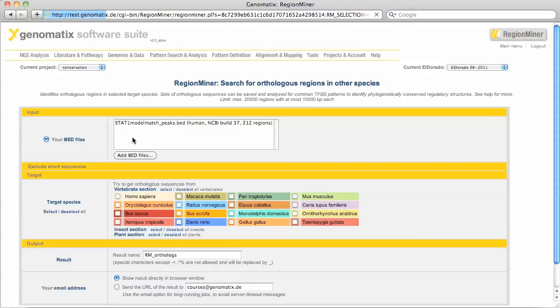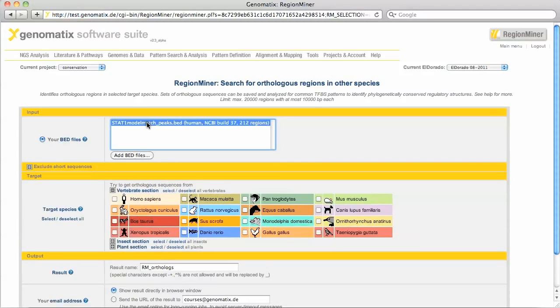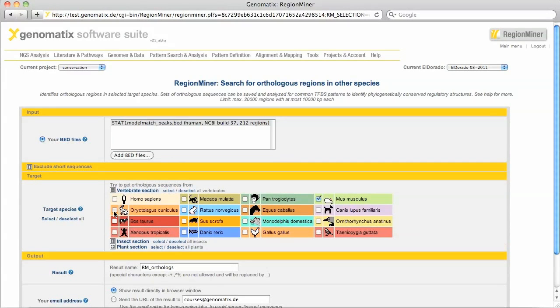Now it's loaded and I can select it in my BED file list. We are going to look for orthologues in mouse, rabbit, rat, horse, dog, cow and pig.